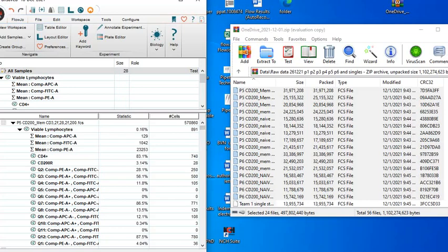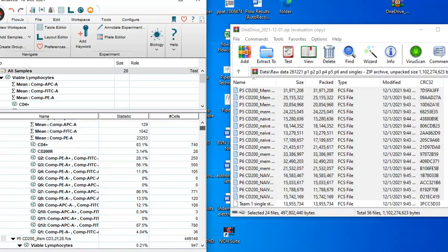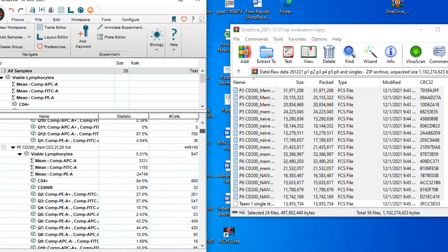So what he's trying to tell you is that in the ones where we block the CD200 receptor, since the CD200 is blocked, all you have is 3.14%. And this is for your memory cells, the ones that we have initially sensitized. And for your CD3, CD28, the ones that we sensitized, still saying the same thing. Your CD4 cells fully expressed 84.5%.